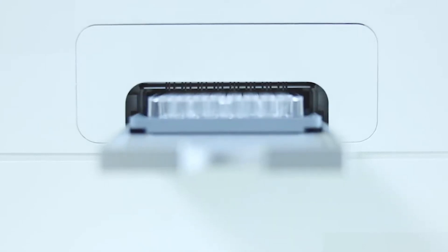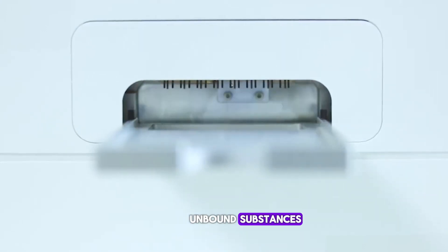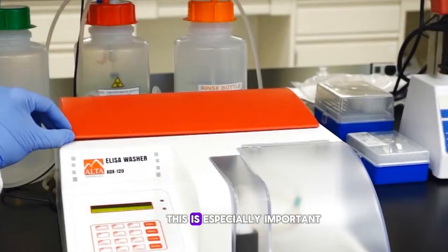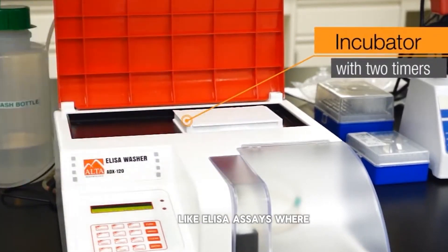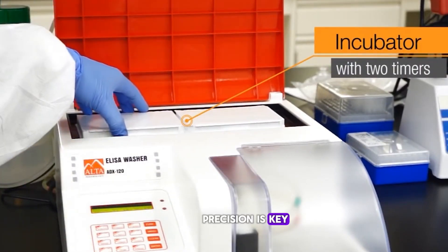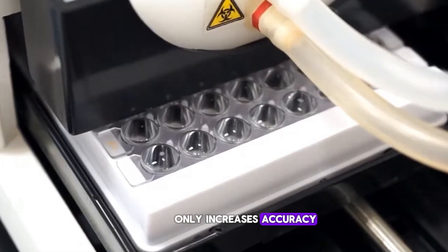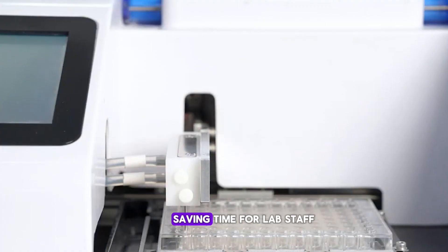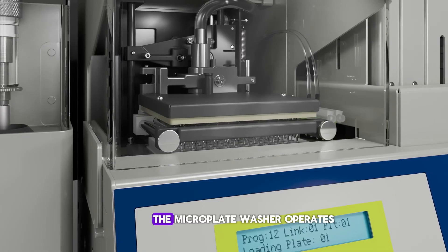Why is this process so critical? Well, washing helps remove unbound substances, reducing background noise that could interfere with results. This is especially important in sensitive assays like ELISA assays, where precision is key. The microplate washer not only increases accuracy but also enhances efficiency in high-throughput environments, saving time for lab staff.